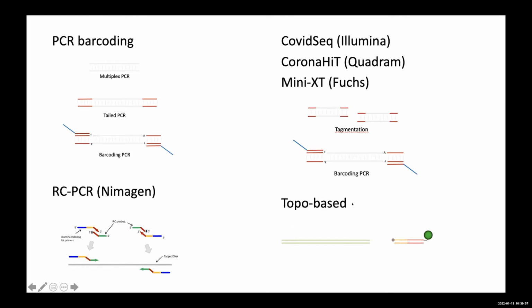And then this one's more future looking. Nanopore have recently announced that there will be topo cloning based library prep kits coming soon. And we've been testing this in Birmingham. I think we're probably the only ones that have tested it, to be honest. The idea is based on topo cloning, which uses topoisomerase and is designed for rapid cloning originally. But because ligating an insert and a vector together is analogous to adding a sequencing adapter to your DNA templates, you can modify this idea to work with sequencing libraries. The only requirement is that you need blunt dephosphorylated amplicons.